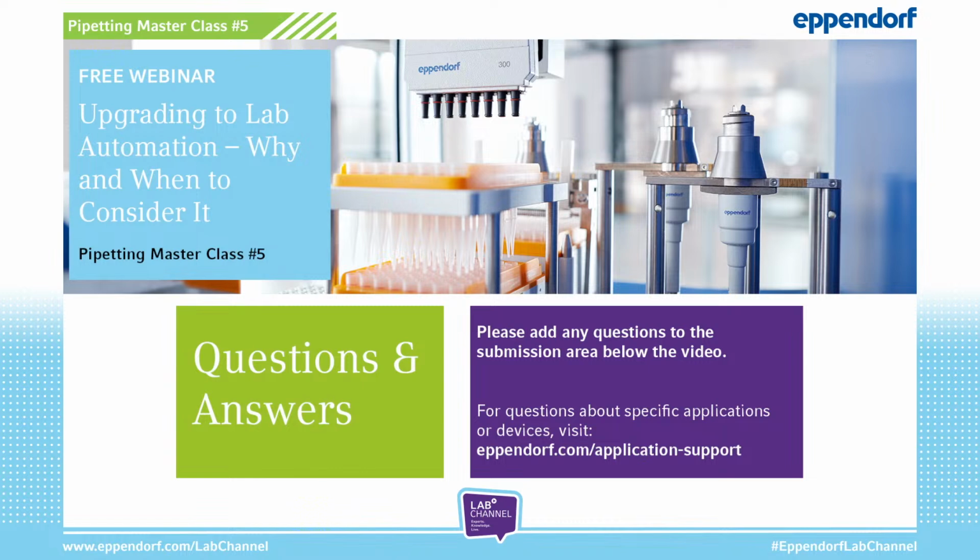So when I look at our fully automated EP motions, they are equipped with a UV light and a filter, but it is not a completely sterile surrounding like you have in a biosafety cabinet. You don't have any active airflow inside. When we talk about our smaller semi-automated devices, like the EP Motion 96, or there are also devices from other suppliers, these usually can be easily placed and operated in a laminar flow hood, and there you can use that, of course, for sterile sample dilution.